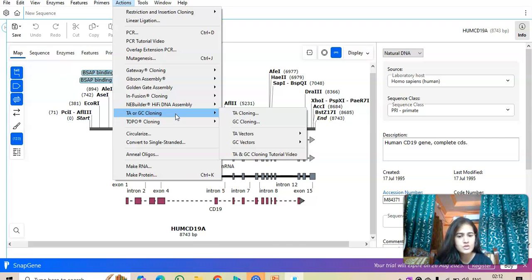And topoisomerase is also a common molecular enzyme that is being used to reduce the topological deformities, and this topoisomerase will be used for the ligation. It is very efficient for ligation, and when we are doing it in test tubes, in vitro, it hardly takes 5 minutes for ligation and it's very efficient. So we rely on that enzyme a lot while cloning and other molecular experiments.